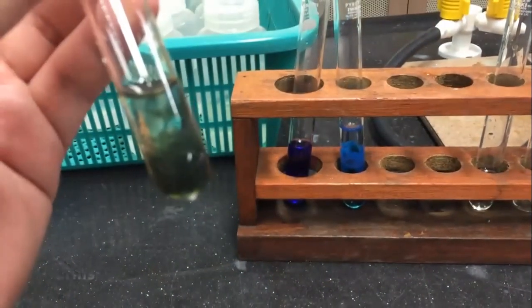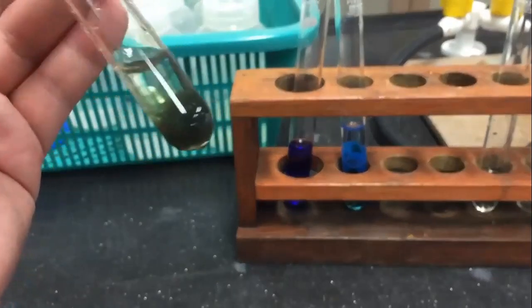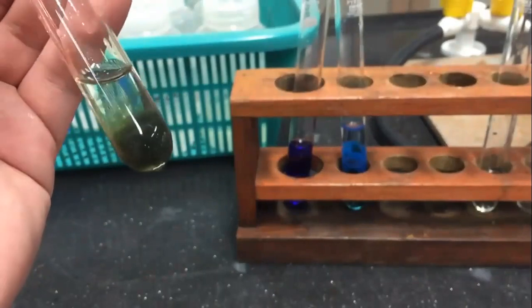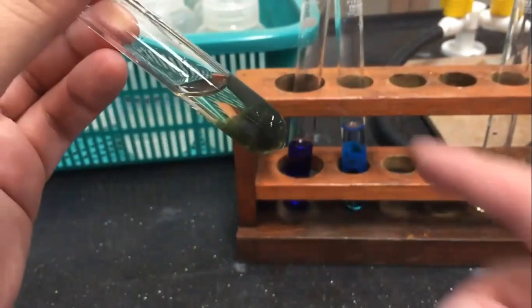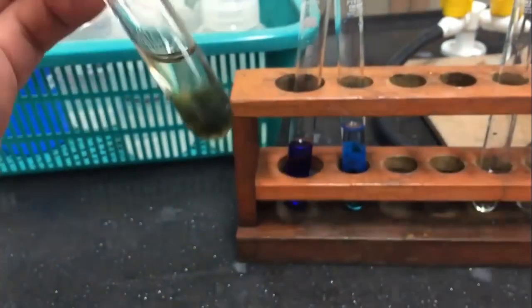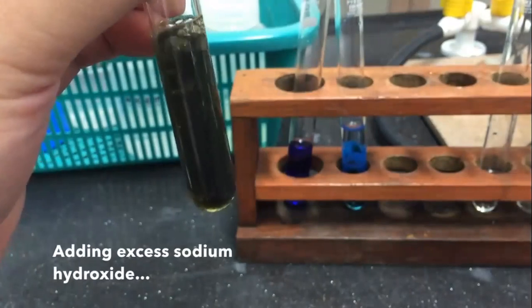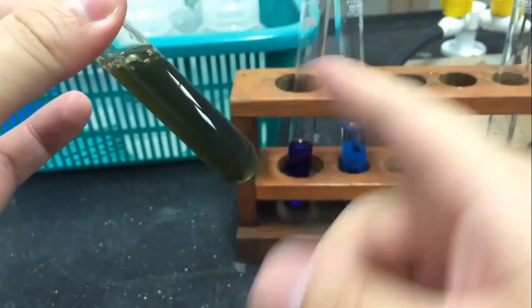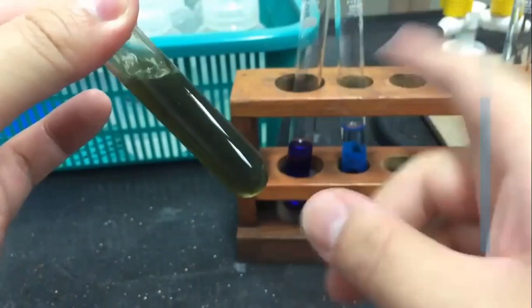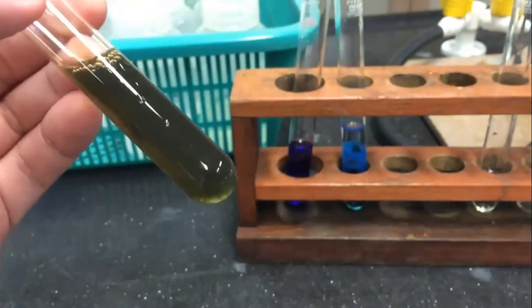You will notice that a dirty green precipitate forms immediately. Proceed to add an excess of sodium hydroxide solution. You will notice that the dirty green precipitate remains insoluble in excess sodium hydroxide.